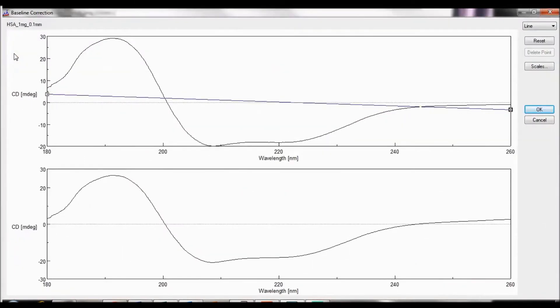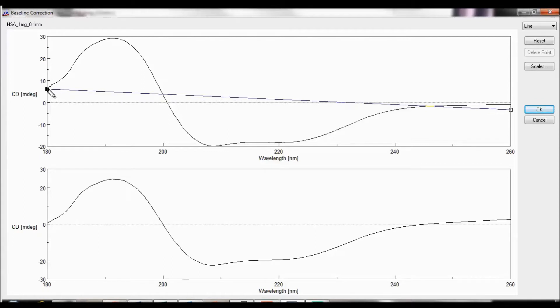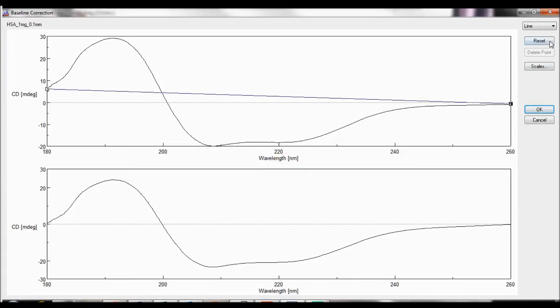You can select whether to use a straight line or a spline curve for the baseline correction. In the spectrum display area, the boxes on either side of the spectrum can be moved to change the baseline shape. Simply hover your mouse over the box until the tweezer icon appears and drag the square to the location on the graph which you want to adjust the baseline. Selecting Reset restores the baseline to its original shape. To apply the baseline settings, select OK.